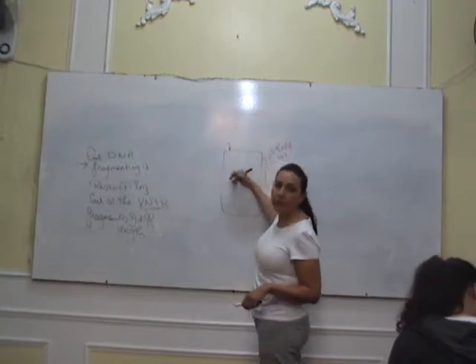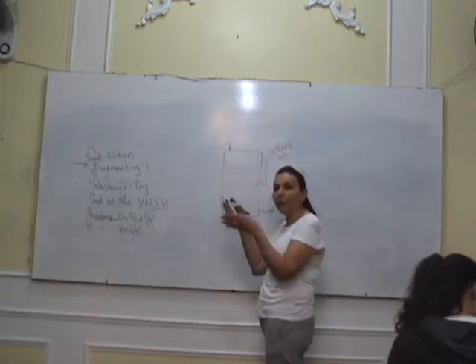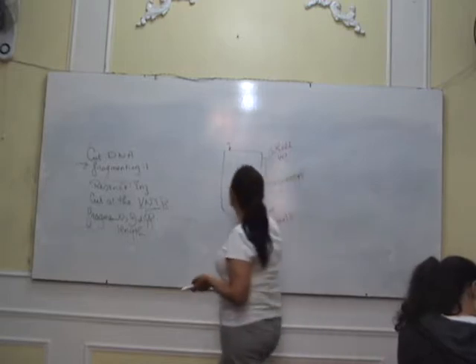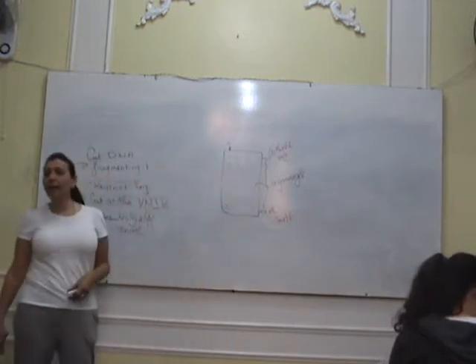The speed of movement is determined by the size of the fragment. The smaller fragments move faster and move furthest towards the anode. This separates the DNA according to its length.